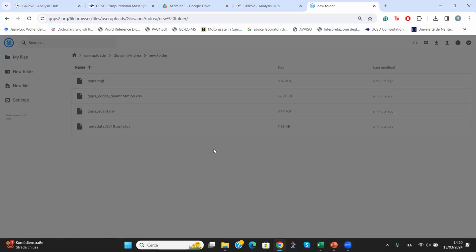If there is someone who still needs some time to do it, just raise your hand, no problem, just so I understand when I can go. No, I think in the future you will be able to create your own account very easily, but right now it's not yet available in this form.